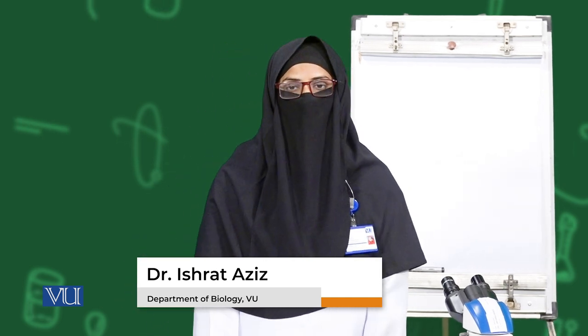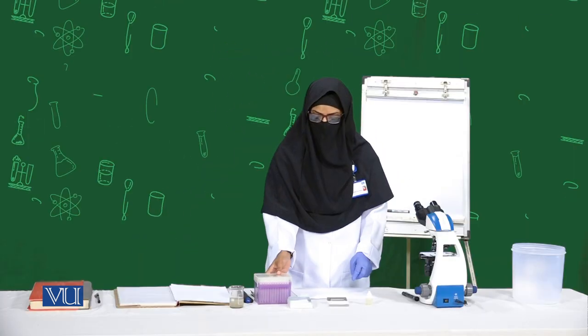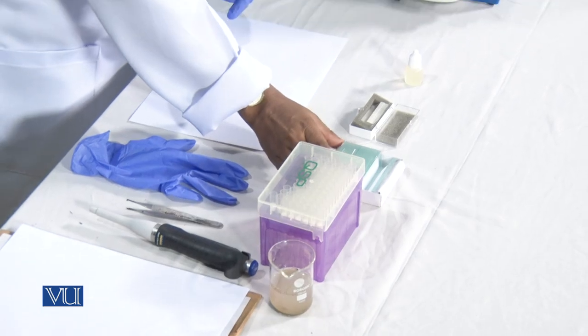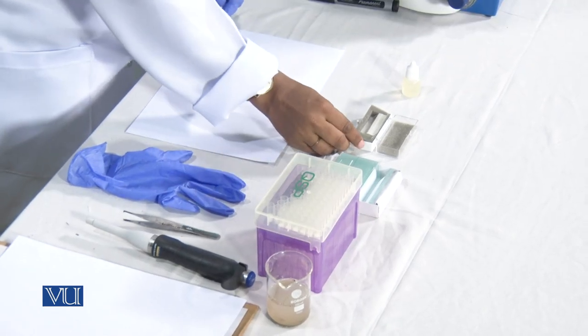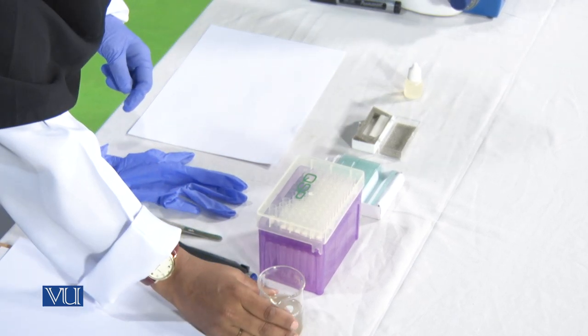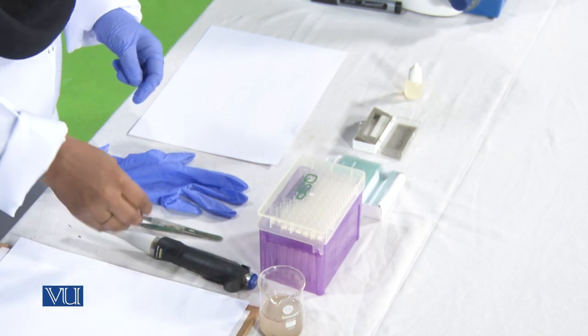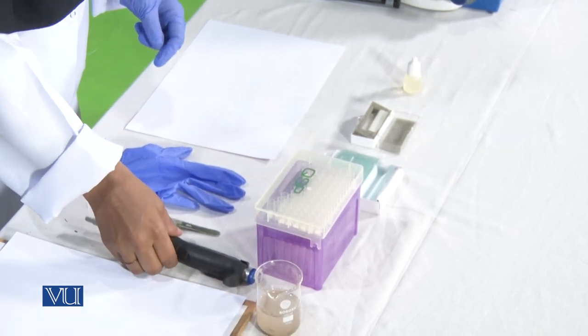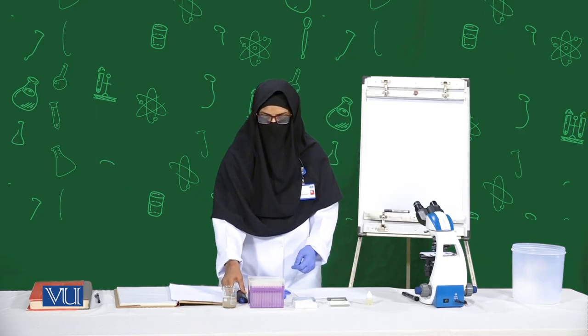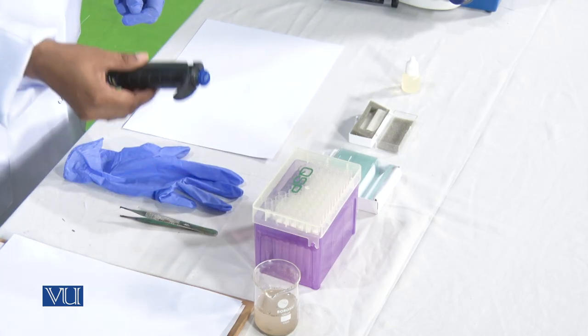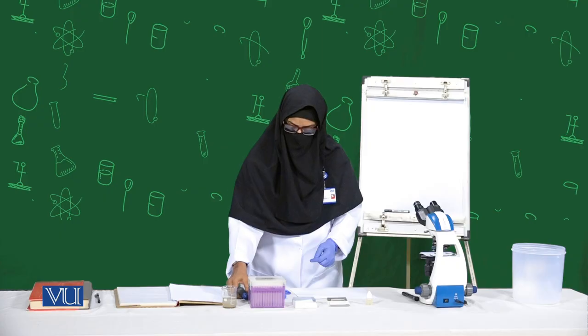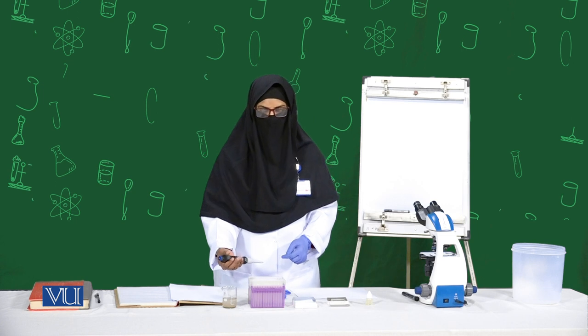The materials required are slides, cover slips, the specimen which is pond water, and for taking the specimen, a dropper could be used. But here for proper measurement we are using a pipette and tips. Now the procedure.